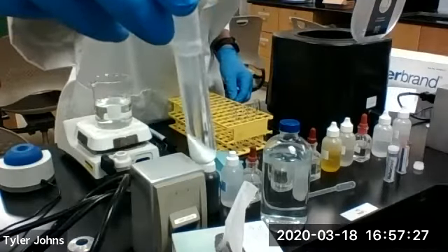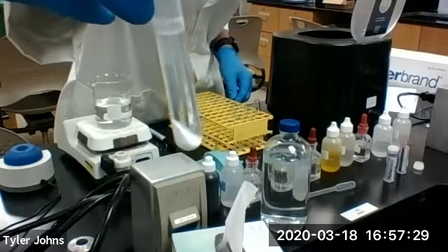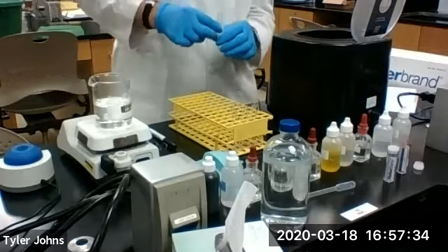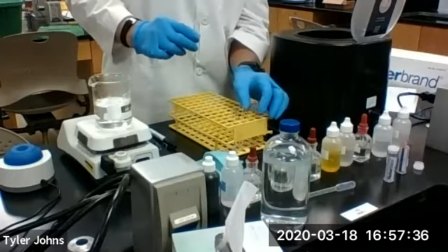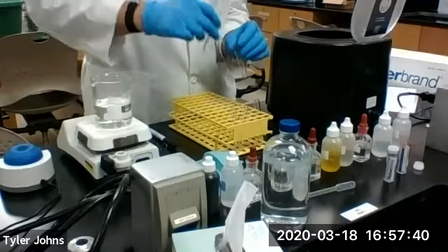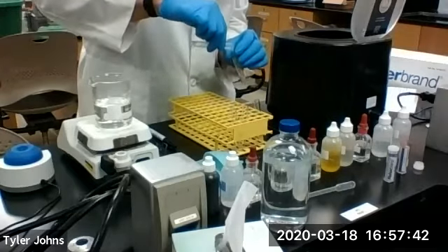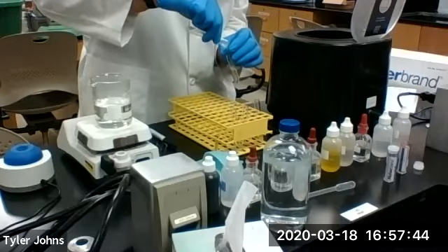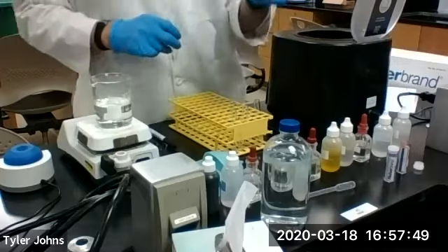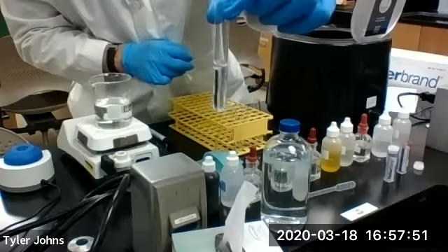We have now centrifuged the precipitate down to the bottom of the test tube. We're going to decant the solution into an alternate test tube.